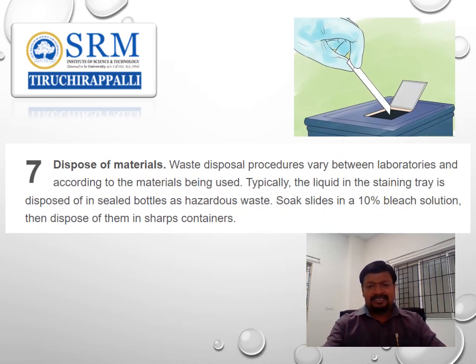Dispose of the material. After using or after identifying the microorganisms, remember that some bacteria are very virulent, and some are pathogenic. The waste disposal procedure varies between laboratories and according to the material being used. Typically, the liquid in the stain tray is disposed of in a sealed bottle as hazardous waste. Soak slides in a 10% bleach solution, then dispose of them in sharps containers.